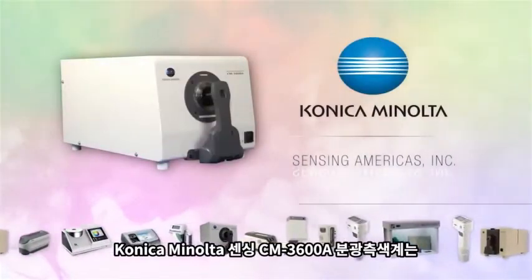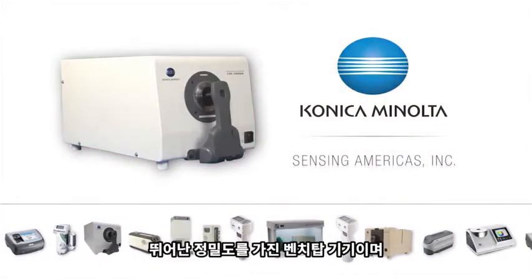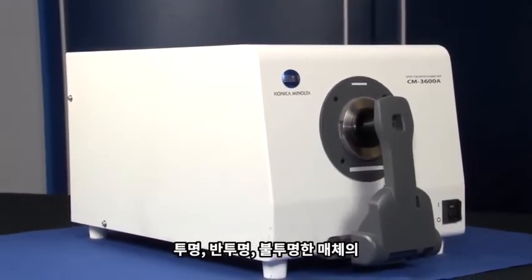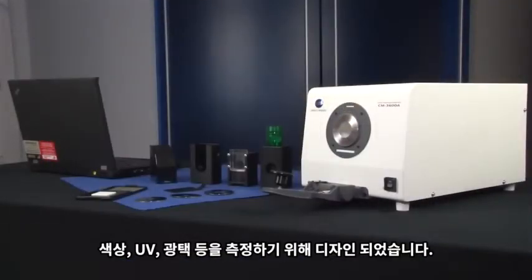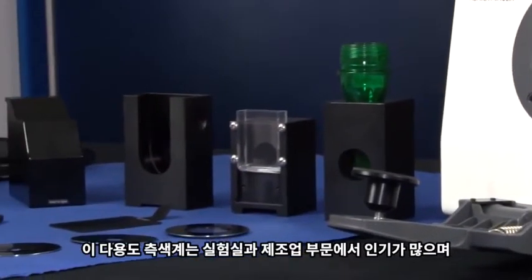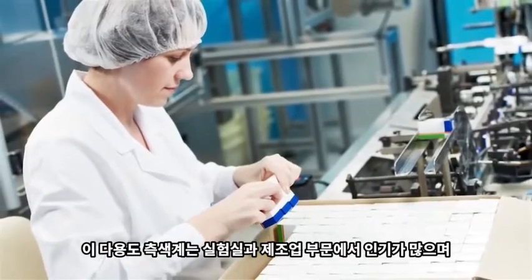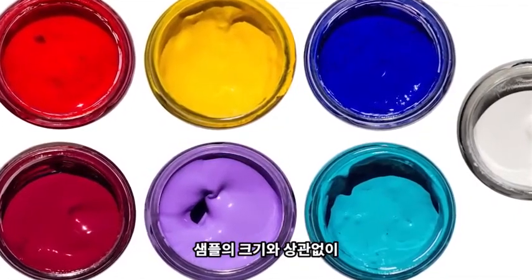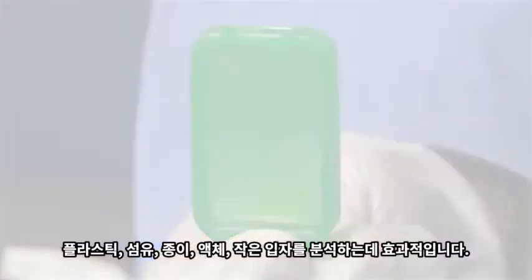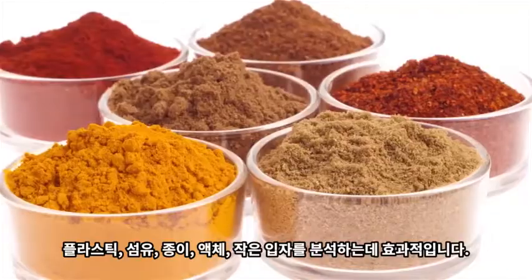Konica Minolta Sensing's CM3600A Spectrophotometer is a high-precision benchtop instrument designed to measure the color, UV, and relative gloss characteristics of opaque, transparent, and translucent materials. This versatile spectrophotometer is popular within laboratory and manufacturing environments for evaluating the appearance of samples small to large in size, including plastics, textiles, paper, liquids, and fine particles.